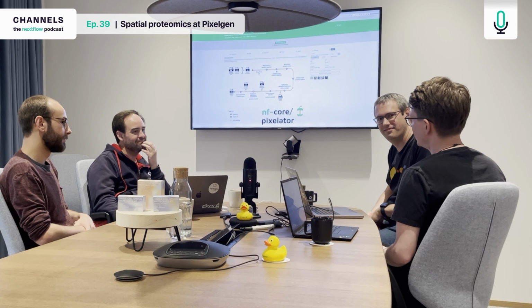Nice. In terms of functionality that is upcoming and that you can already try today, Pixelator is being developed in the open, so you can go in and see the changelog of everything that's unreleased as of yet. We haven't quite finished it yet, but one major thing that is coming out is a new stage in the pipeline eventually, a new command that we're calling Pixelator Layout.